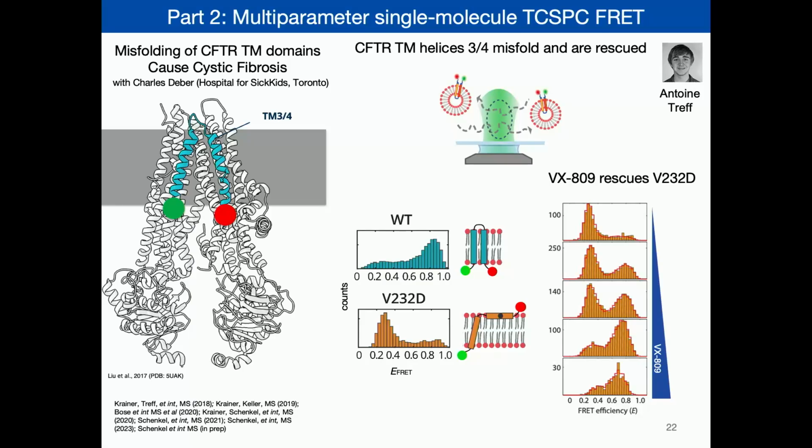And that was super exciting for me, also for Antoine, for the entire lab, because that said, well, we have now with FRET a very simple readout. We don't even need to measure the exact distance here in this case. This is a readout: am I in state 1, correctly inserted, or in state 2, incorrectly inserted.